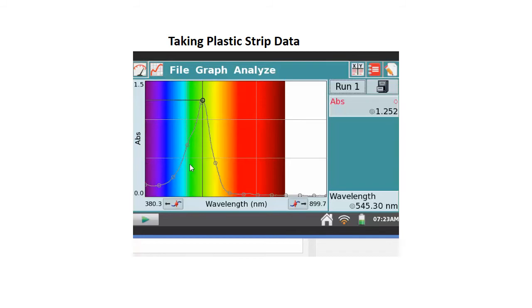So somewhere down in here I want to click, so I'm going to click in here, and it's about 0.383. I might go just a little bit lower than that just for fun. I'll go down to there, 0.330, and that's good. You can also click over on this side and same result. Doesn't matter. We don't care which side you go on.